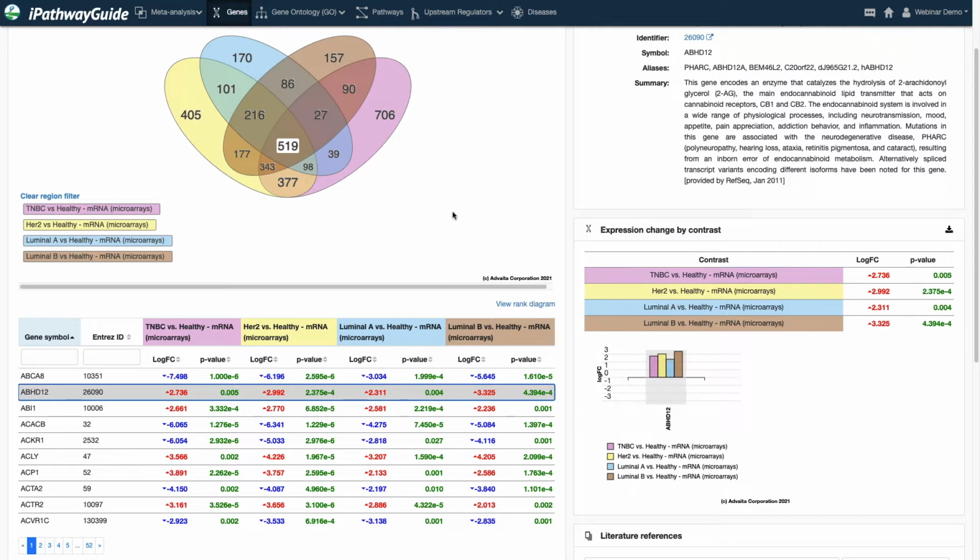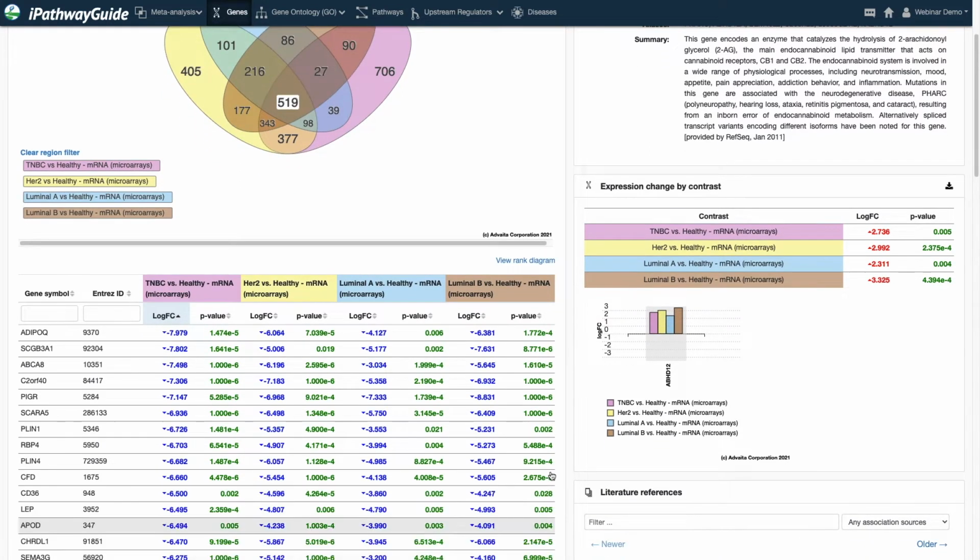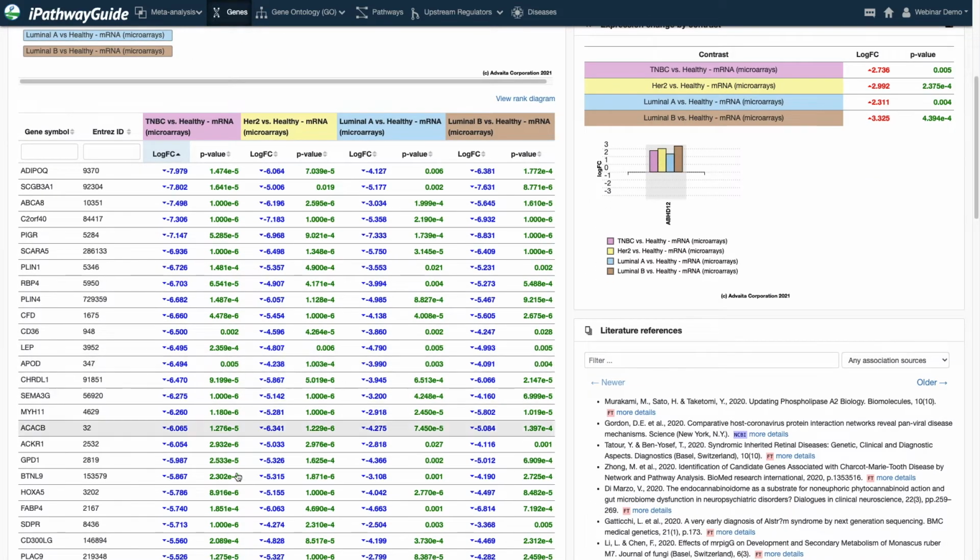So what we can do, a really quick way to find biomarkers, is simply to sort this table by fold change. And we're going to sort by triple negative because we're curious about a biomarker that would uniquely identify the triple negative condition. And we're just going to open this up and scan with our eyes. We're scanning for a change in color.